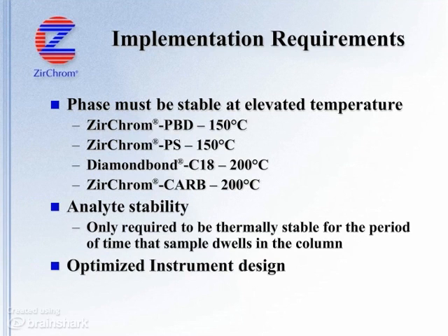Finally, the instrument you choose for the analysis must be optimized for elevated temperature. Extra column volume should be minimized whenever possible, and we recommend using a heater that has been optimized to eliminate thermal mismatch band broadening.